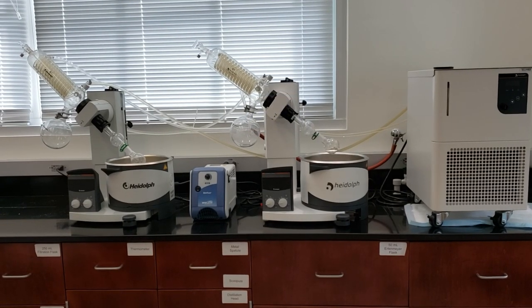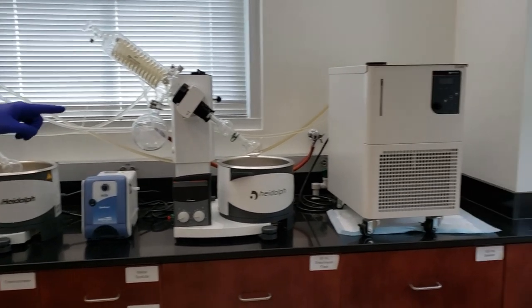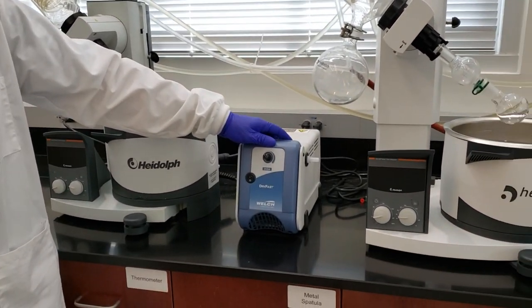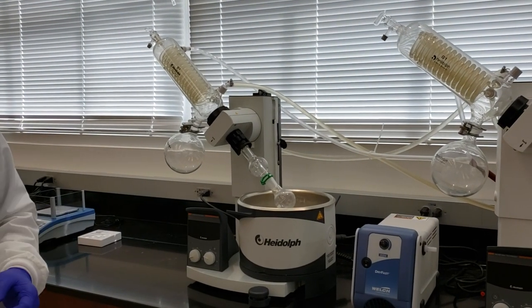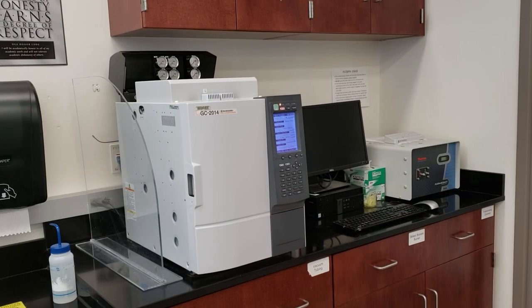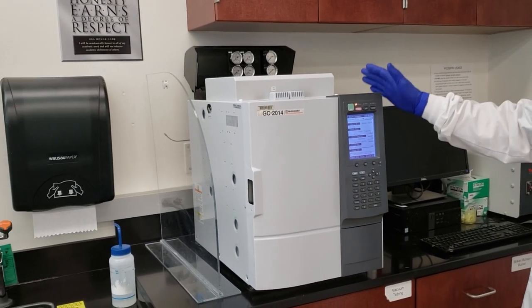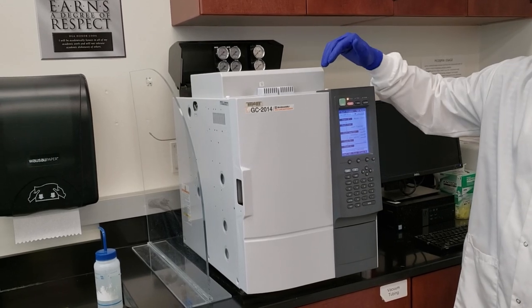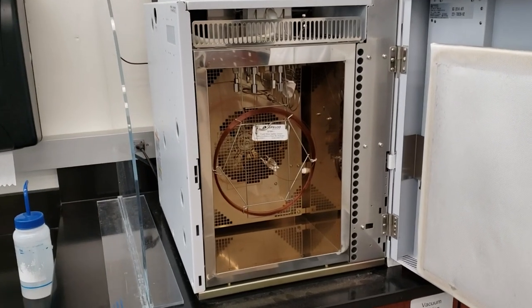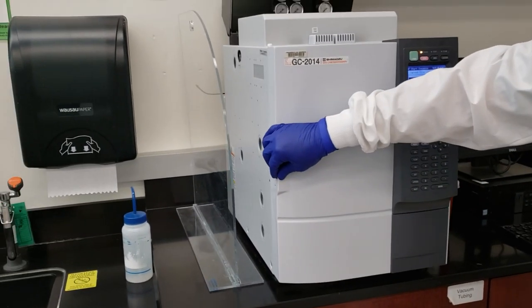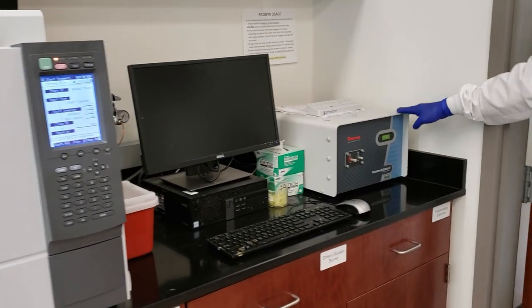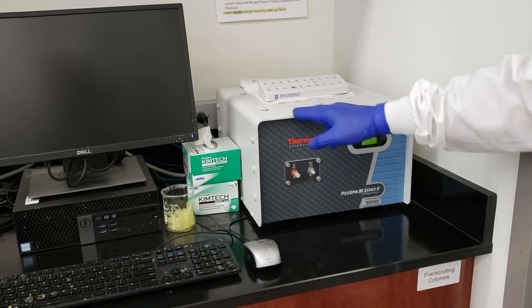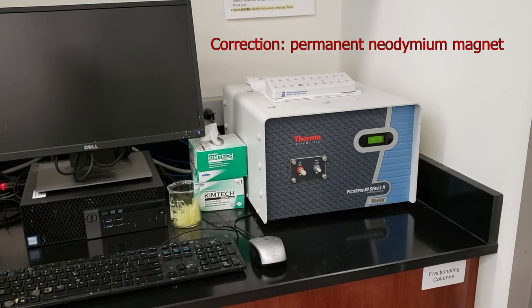The final instrument in the back is our series of two roto evaporators and our chiller unit here. The chiller cools liquid flowing through our evaporator coils. We have our vacuum pump, all designed to drive solvent off of a reaction solution so we can obtain pure product. The final two instruments are our GC, a Shimadzu GC 2014 with two detectors, a TCD detector and an FID detector. If we look inside we can see the two columns in our oven section. We'll use this to separate volatile liquid mixtures. Next is our proton NMR, a PicoSpin desktop NMR, Series 2 PicoSpin 80, with inlet and outlet taking in a capillary loop through the center of an electromagnet allowing us to collect proton NMR spectra of all our products.